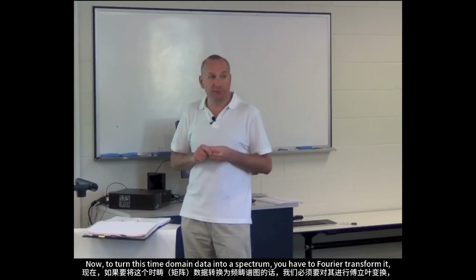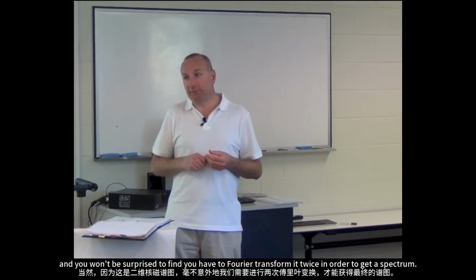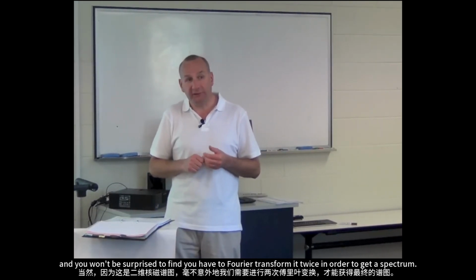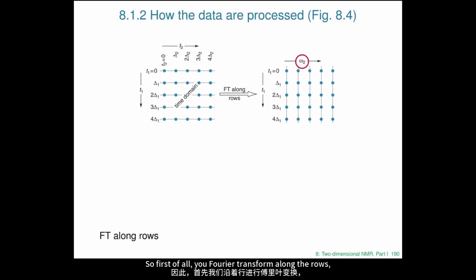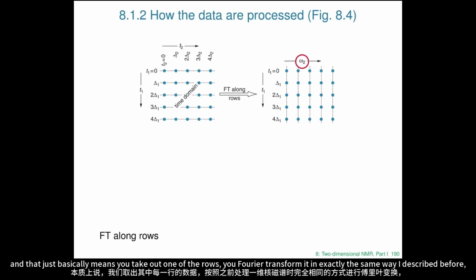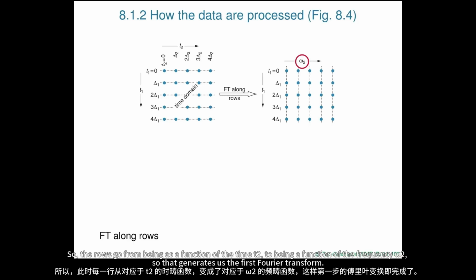Now to turn this time domain data into a spectrum, you have to Fourier transform it, and you won't be surprised to find you have to Fourier transform it twice in order to get a spectrum. So first of all, you Fourier transform along the rows, and that just basically means you take out one of the rows, you Fourier transform it in exactly the same way I described before, and you put that back into the matrix, and then that's a spectrum. So the rows go from being a function of the time t2 to being a function of the frequency omega 2. So that generates us the first Fourier transform.